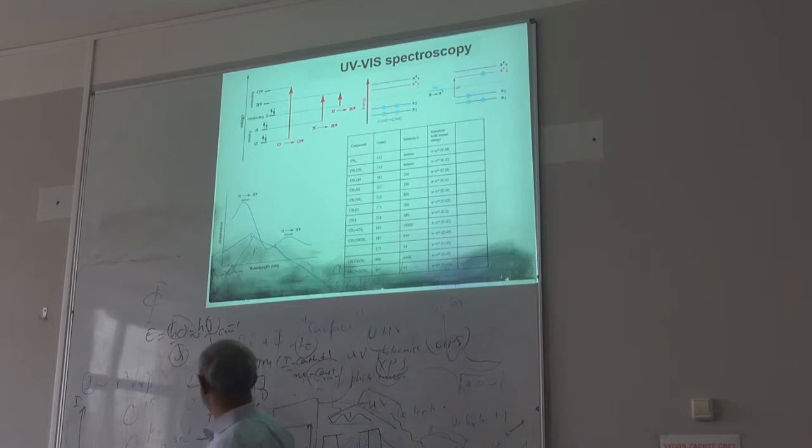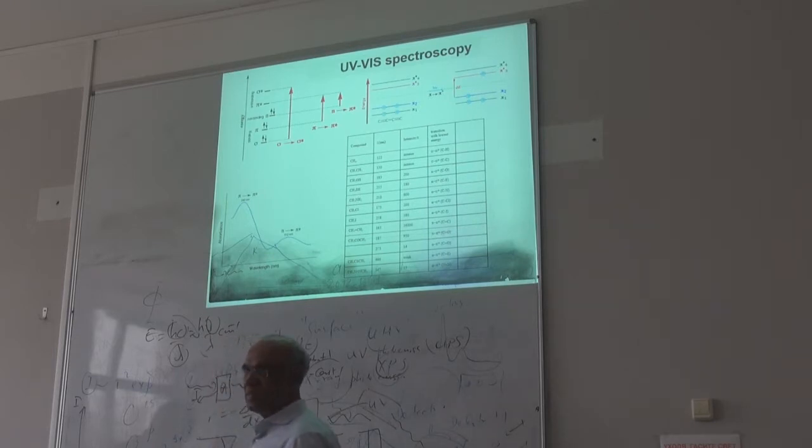Your incoming light is the transmitted one plus the reflected one plus any absorption, right? That's what we need basically. So if you measure T, you can get information about your absorption. But if your sample is a solid material like this, light cannot go through, so we use something called diffuse scattering, reflective measurement.